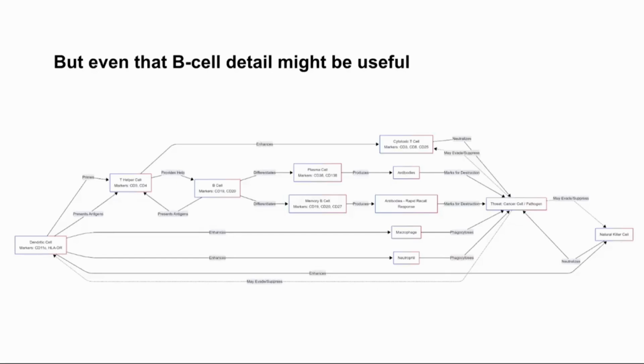So hopefully this gives you a preview of why exploratory is getting a bad rap as well. And in general, why these 3 terms, limited, detailed, and exploratory, might be useful in cytometry.